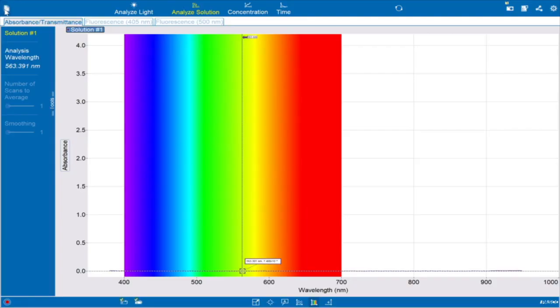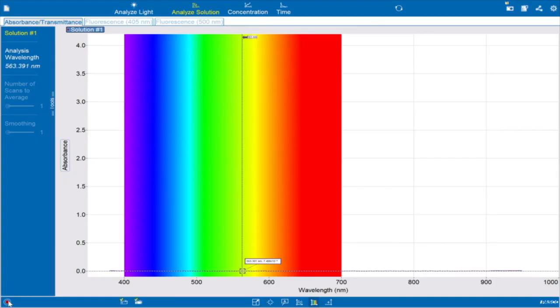The Concentration setting allows us to measure the absorbance of a solution for a specific wavelength at various different concentrations. We'll use this later in lab today to determine the concentration of your unknown solution. The Time setting allows us to measure absorbance of a wavelength over time. We won't be using the Analyze Light setting in this class. You can also open saved data from the same place. In the top right corner, there are options that allow you to take snapshots of your data to share with your lab partner. To the left of these icons is a symbol that indicates whether or not you are connected to your spectrometer. On the bottom left is a red circle — once clicked, it will begin analyzing the solution in the cuvette.